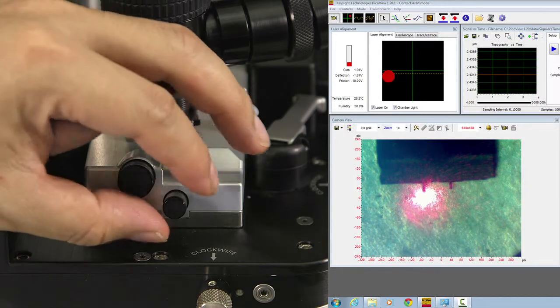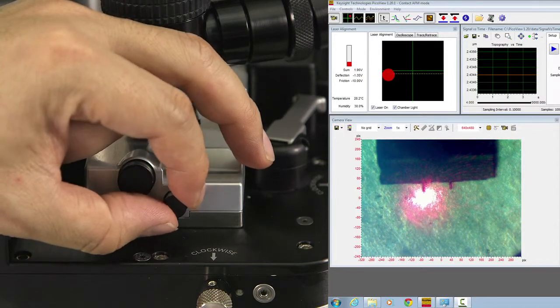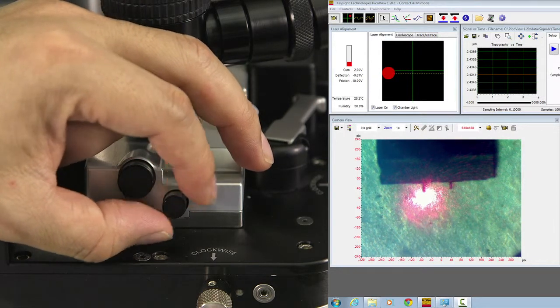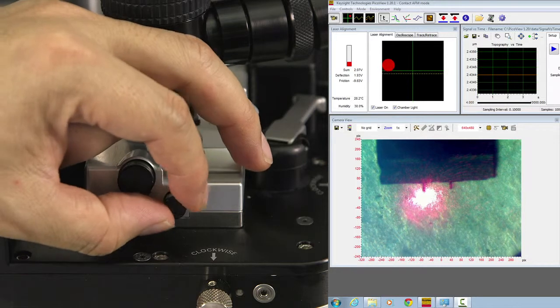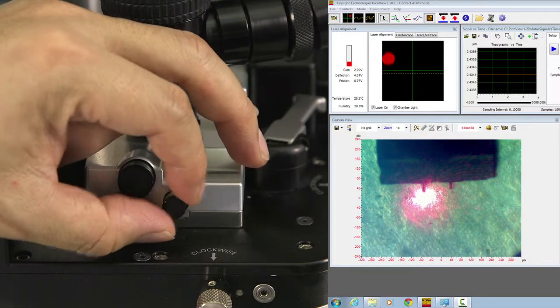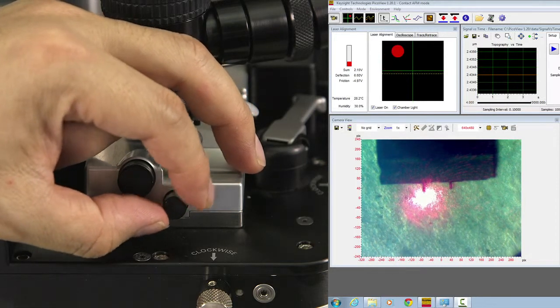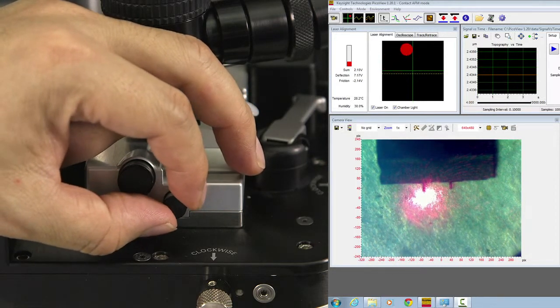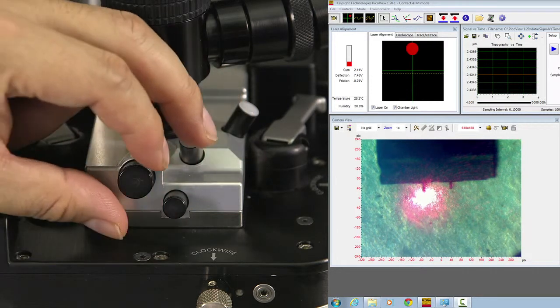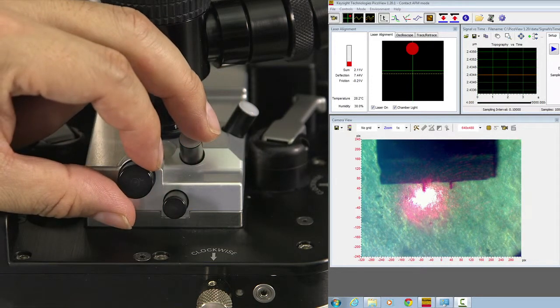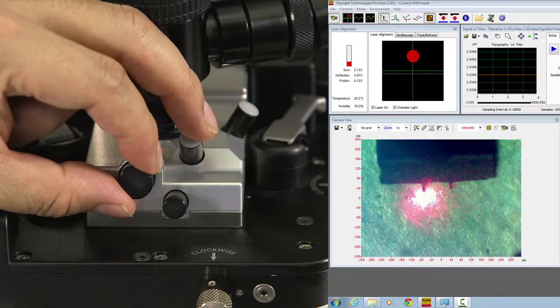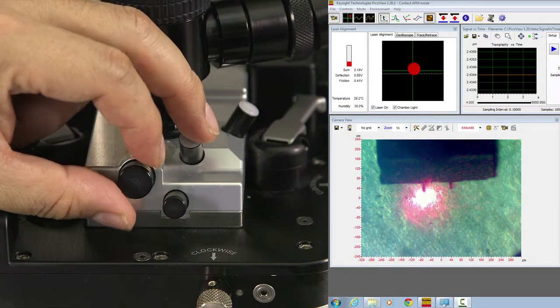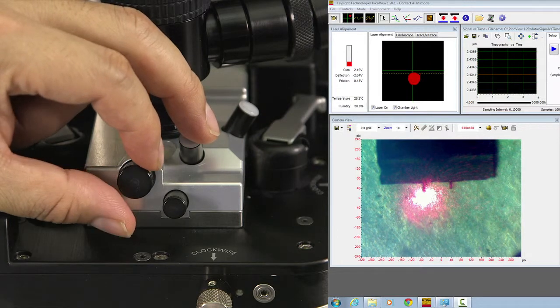Move back to the small knob. Adjust so the sum signal maximizes. When the sum signal is actually maximized, the laser spot will be in the center of the detector.